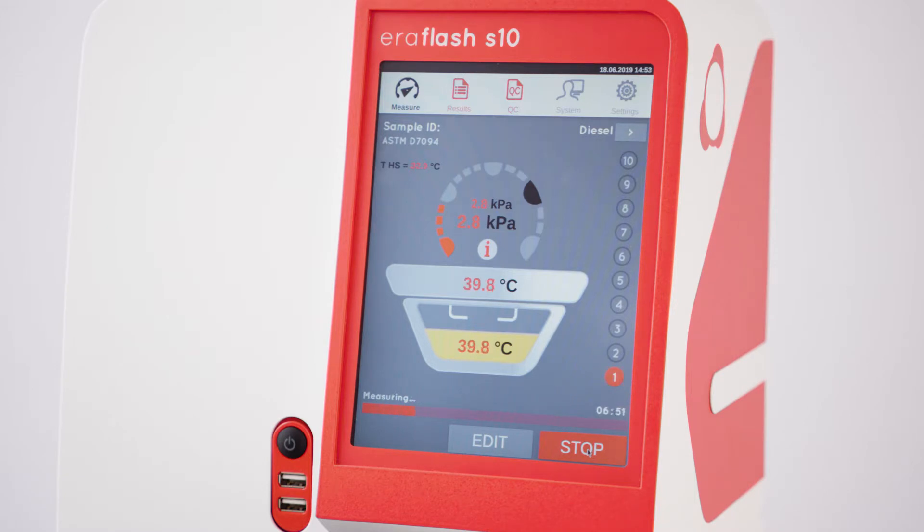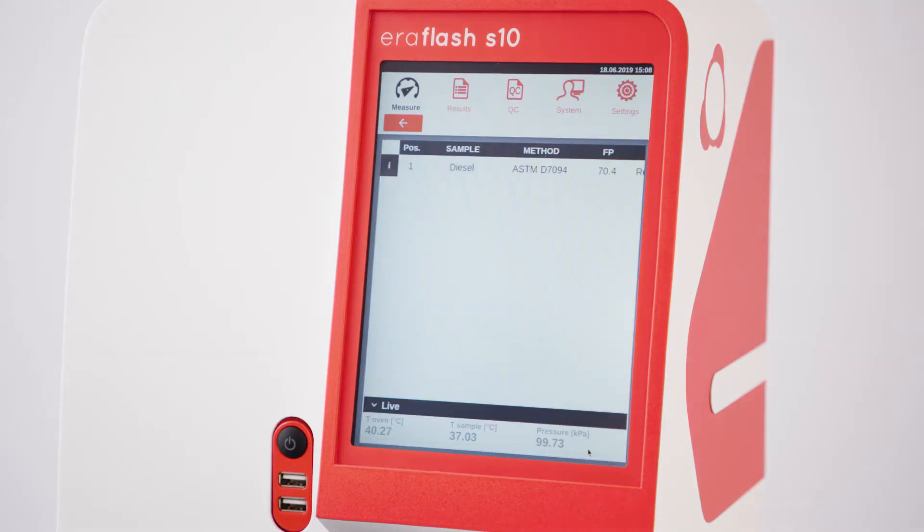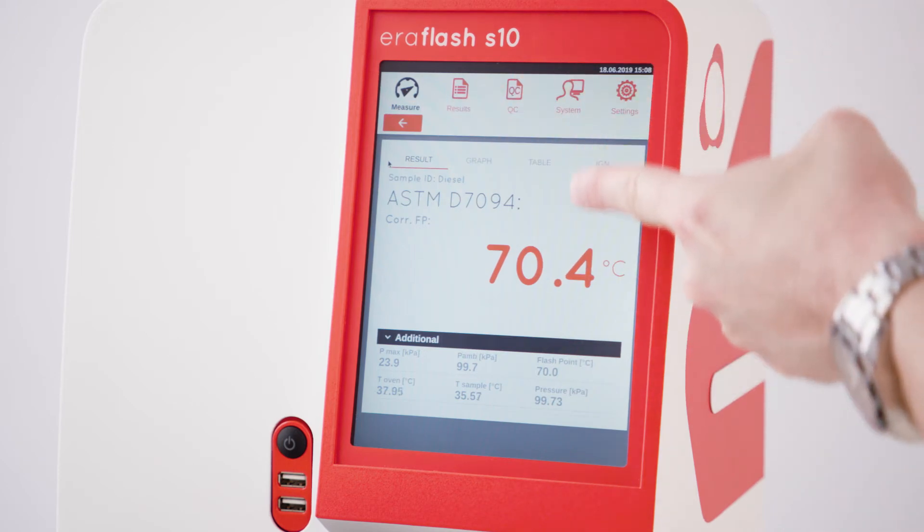Live sensor readings and an illustration of the progress are displayed on the screen during the measurement. The actual measuring time depends on the applied temperature range and is less than 10 minutes for an ASTM D7094 measurement. After the measurement is completed, the result overview screen is shown. It contains the main results of the sample run. The flashpoint is automatically corrected to sea level.